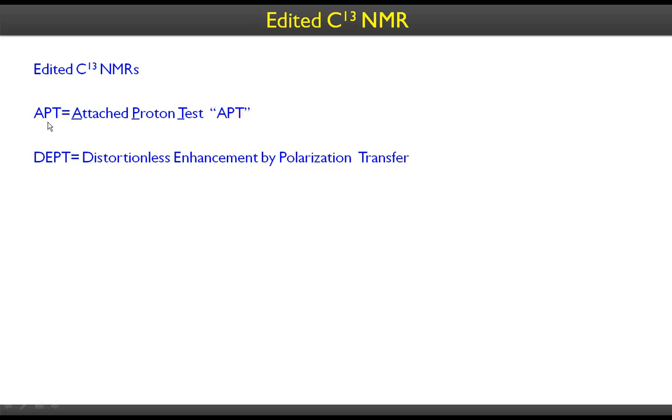So APT is also one type of C13 NMR. That's what you should be remembering. We are not out of carbon NMR; we are in carbon NMR, the broad topic. In that we are learning various techniques. One of the techniques was the off resonance spectrum. It's useful to a certain extent. However, it complicates, so we went for the decoupled spectrum.